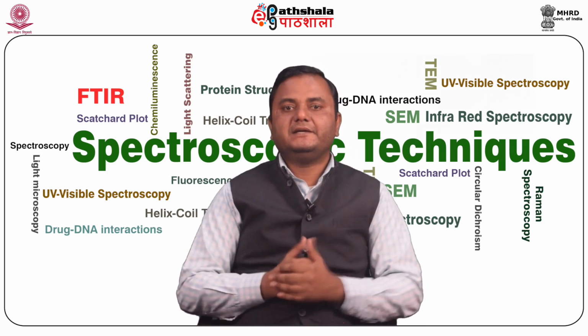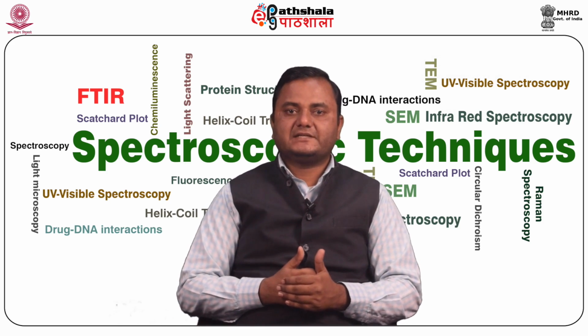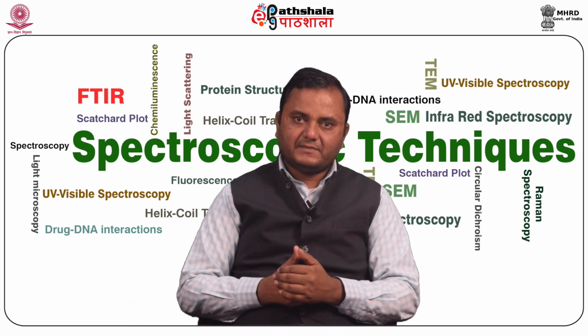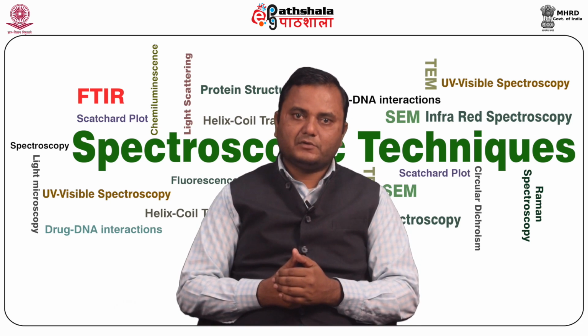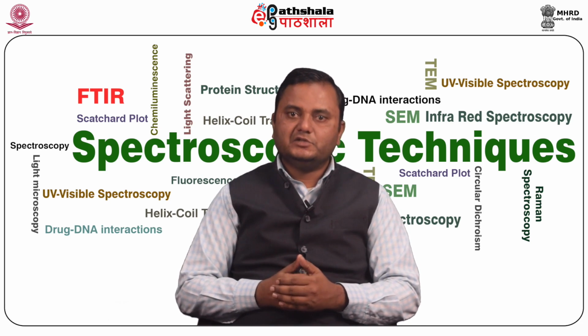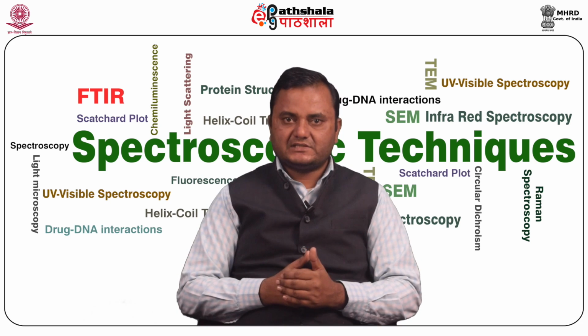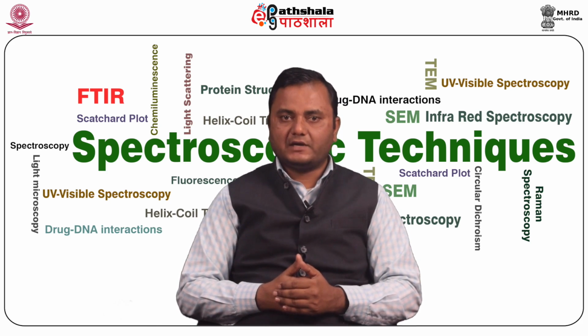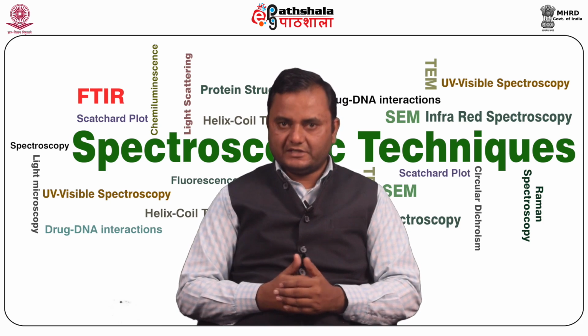There are some thermal detectors which are not used in FTIR. The response times of thermal detectors, for example the thermocouple and thermistor used in dispersive IR instruments, are too slow for the rapid scan time of the interferometer, 1 second or less.